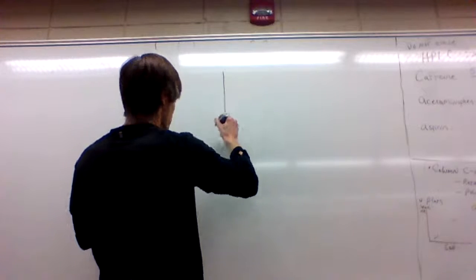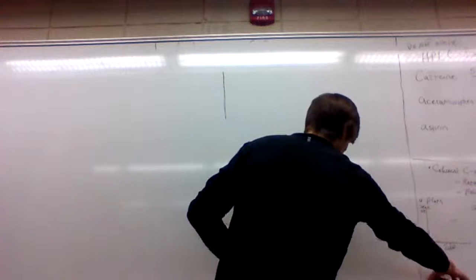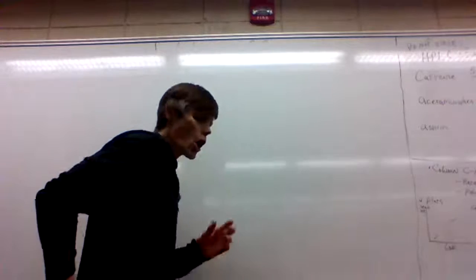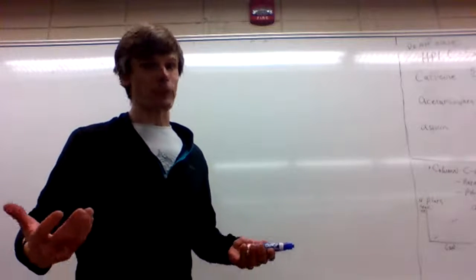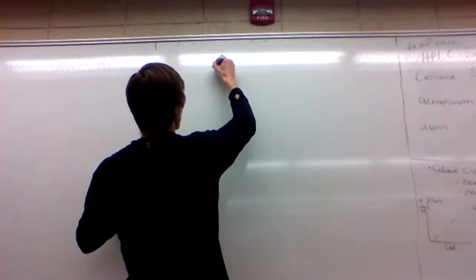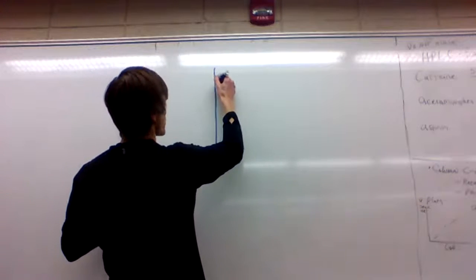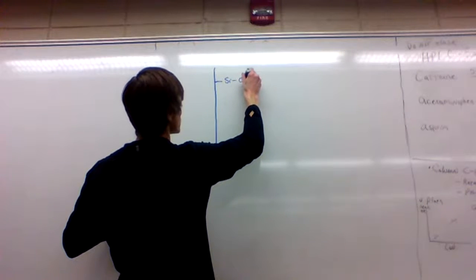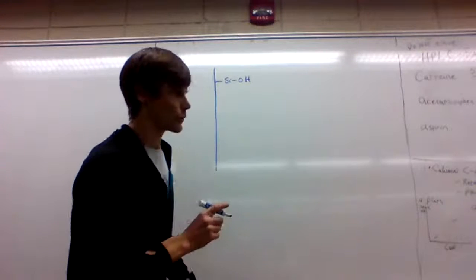Silanol groups. That's big in normal phase chromatography. And remember, we call it normal phase simply because that was the earlier methods. Okay, here's our solid support. That's nice and easy to see. And the solid support has exposed SiOH, and that's what we mean by silanol groups.